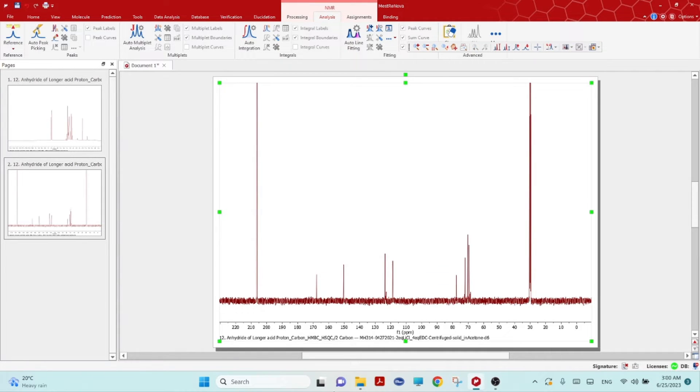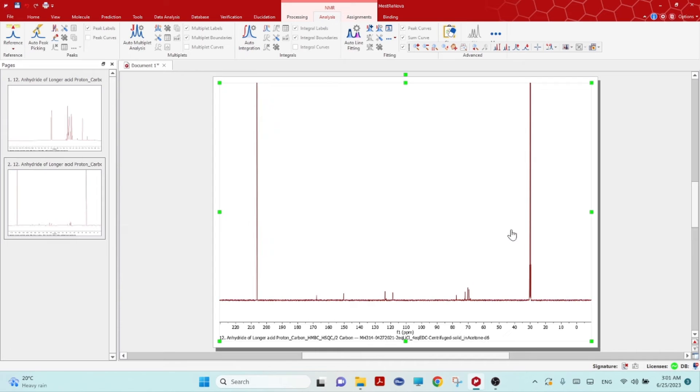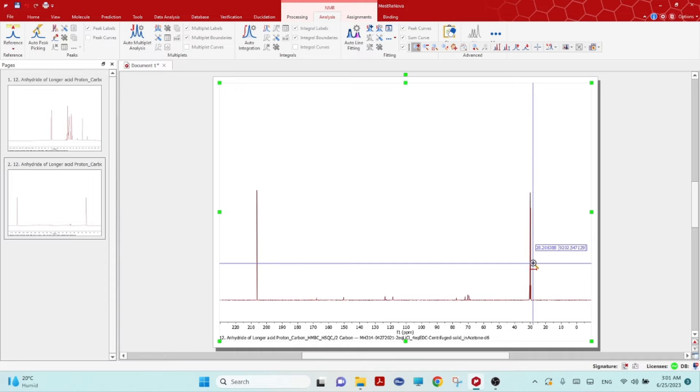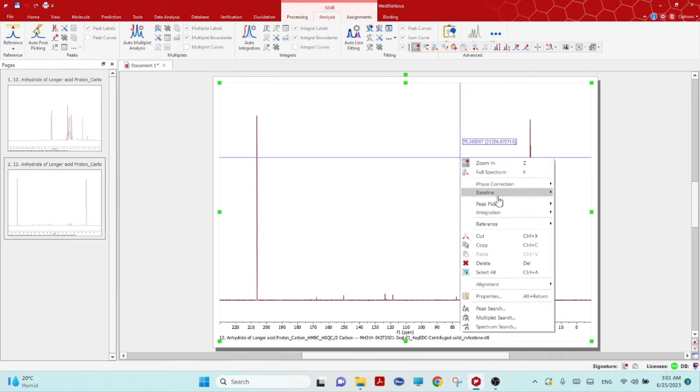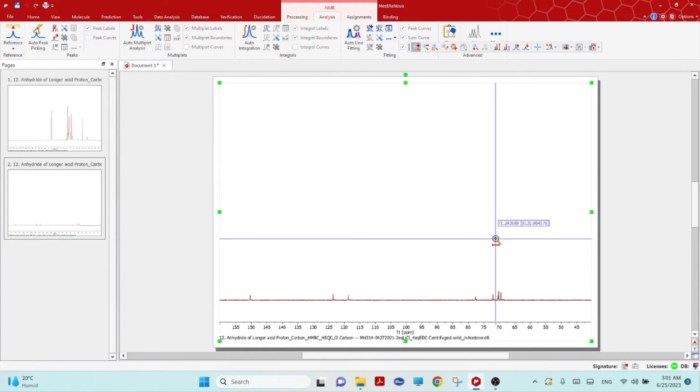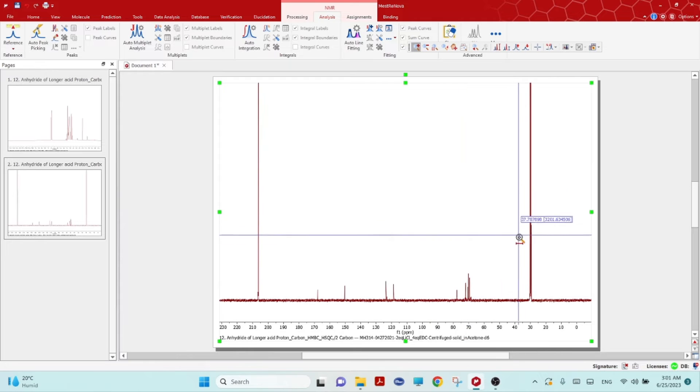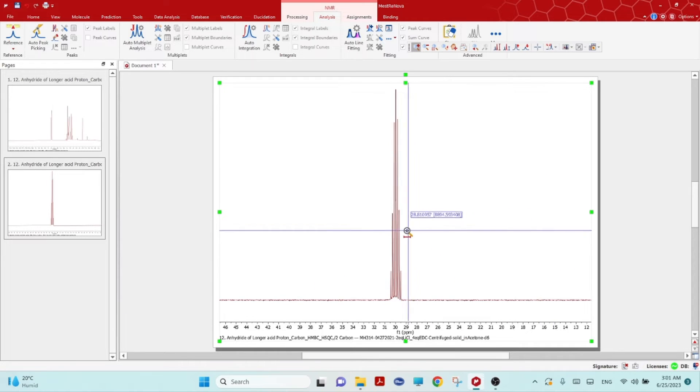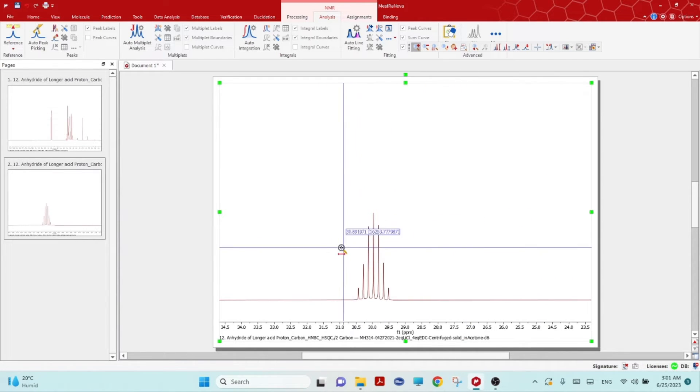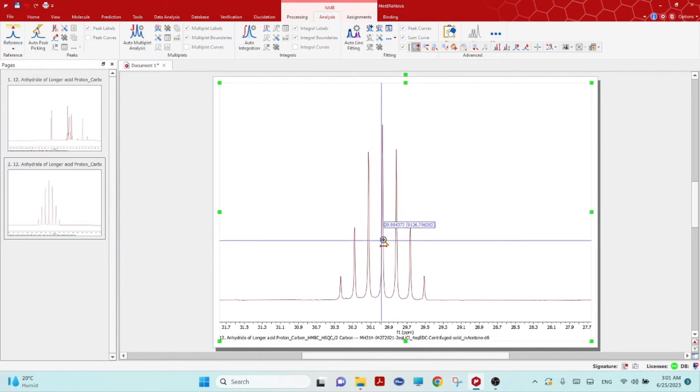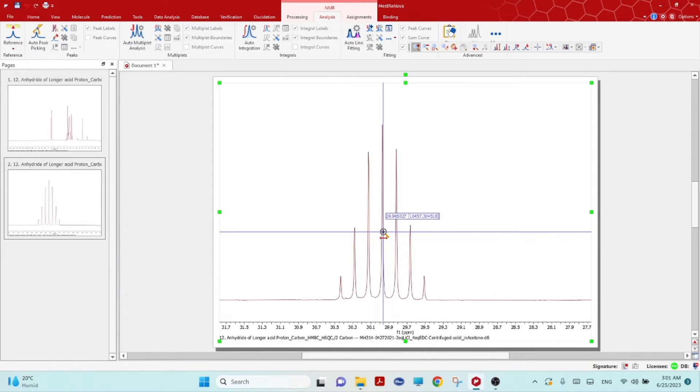Then click OK. If you click Z or right mouse click and click zoom in, you can do again. Then this acetone peak, the middle one, is 29.96, so 29.97. Remember this peak.